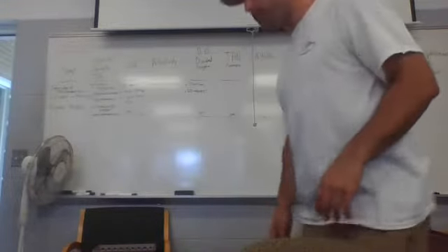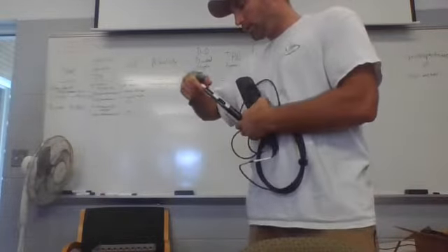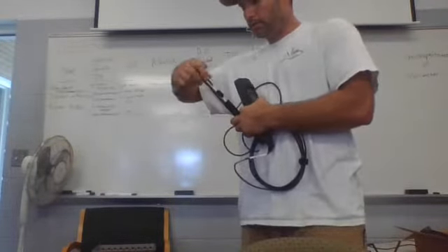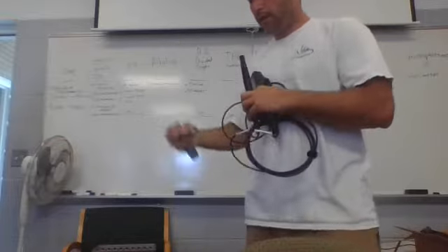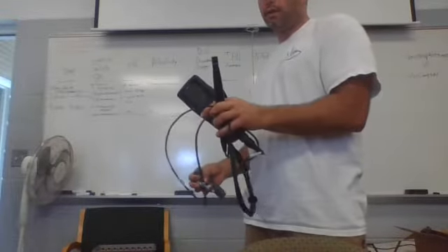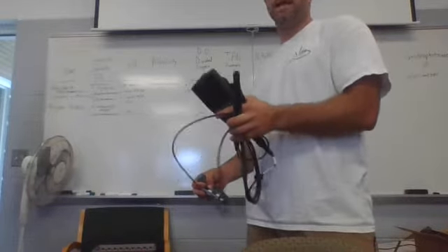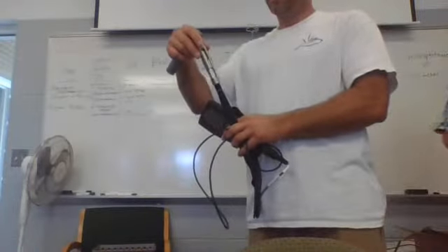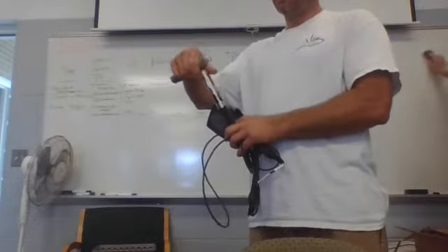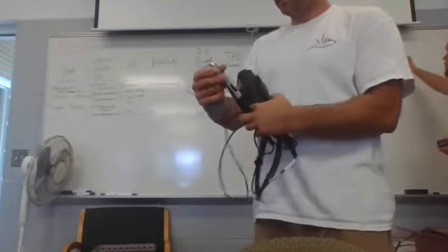But the newest meter that I have is called an LDO meter, or a light meter. It uses a light sensor, and it doesn't have a membrane on it, and you don't have to let it warm up. It lasts a year, and then you change it out. So you just turn it on, and you get a measurement right away. It's much more user-friendly and less maintenance than that other meter. So I'm very excited to have this.